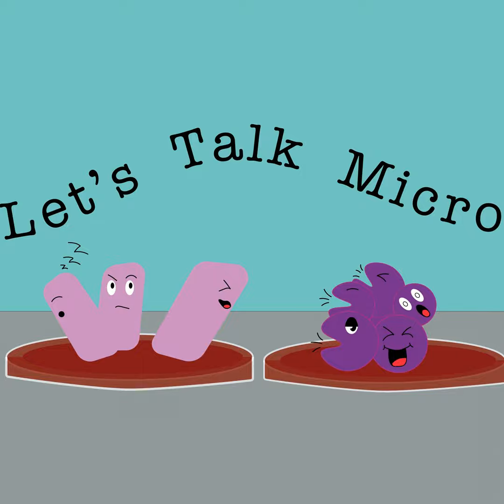So this semester, when I'm back face to face, I said, I wonder if having them do that before we come in the lab will make it easier for them. So I assigned it as a pre-lab for that week and made them all record themselves. And this was probably the first semester ever, and I've been there about 15, 16 years, that I have not had to help one student with their quadrant streak.